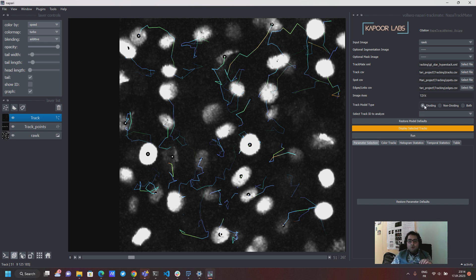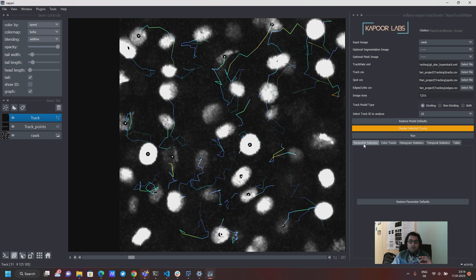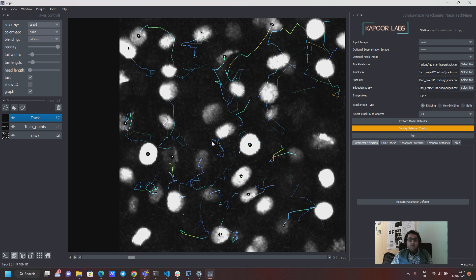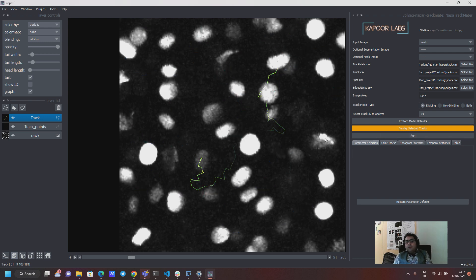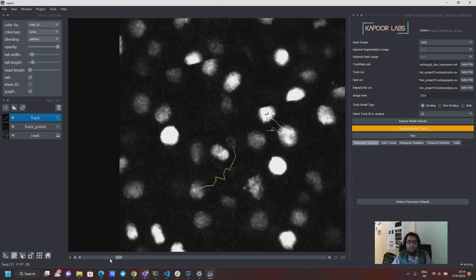And you can always go back and say now I just want to look at my dividing track number 10 again and I'm going to color this let's say with speed. So don't forget to hit this orange button because that's how I program this for now.